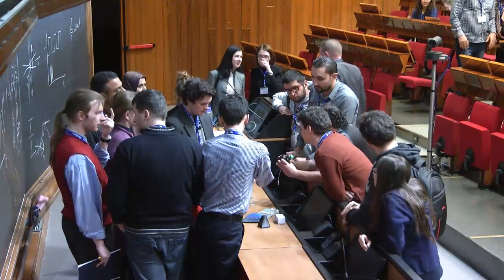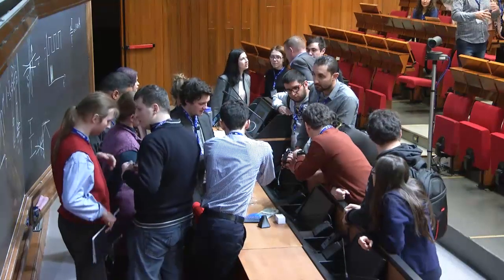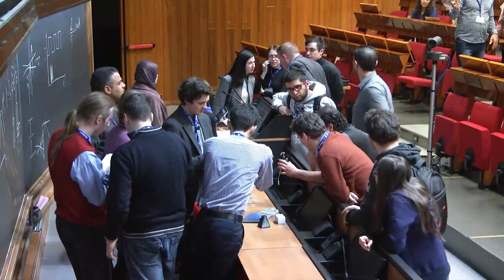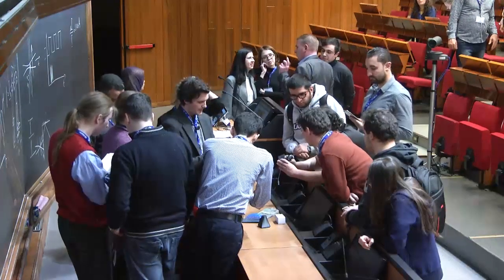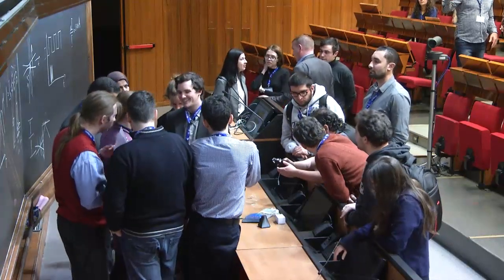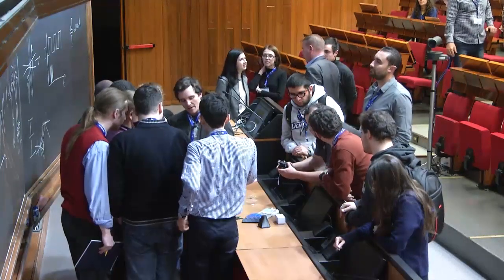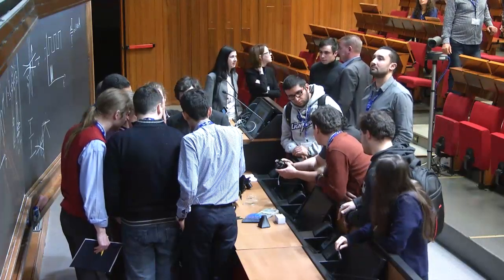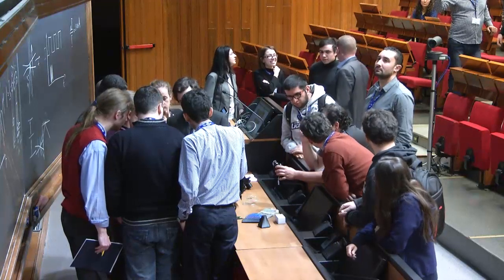So let's see if we're connected to the internet. I can show you the app. It's like nano. So I don't have Giardia samples here because it's really bad to bring on the plane. But I can show you the way the app works with a previously taken image. So I'm going to find an image on the phone.